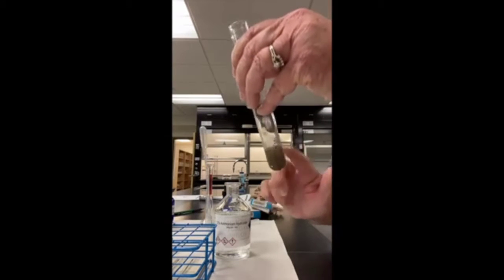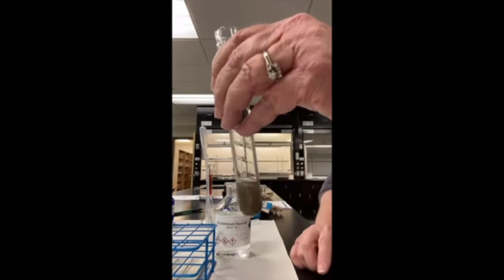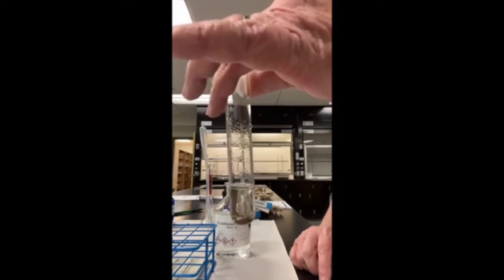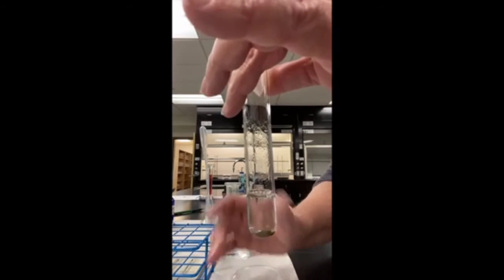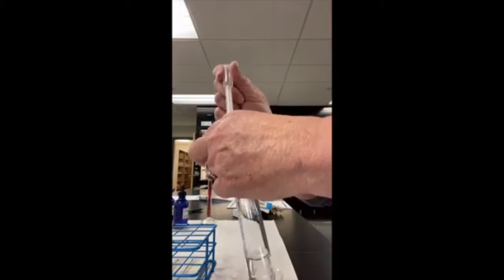And then I'm going to transfer by decanting. I'm going to transfer just the liquid. So I'm going to allow the solid to settle to the bottom, and then I'm going to use a transfer pipette to put it in my test tubes. All right, I'm going to transfer just the liquid, not the precipitate that remained on the bottom.